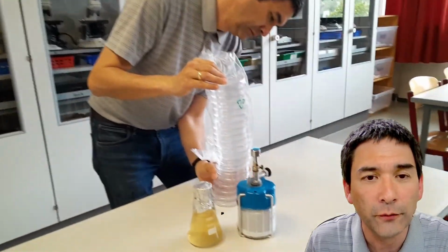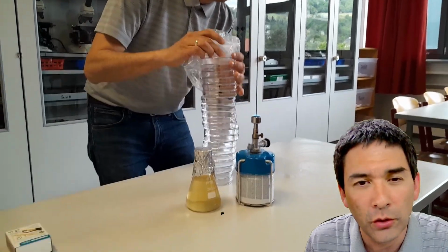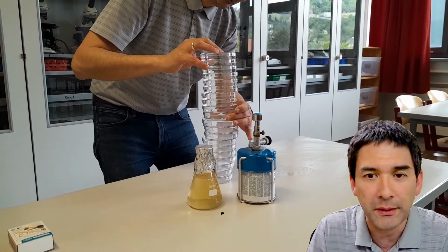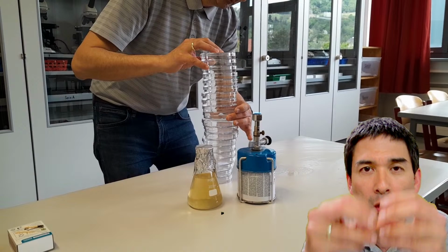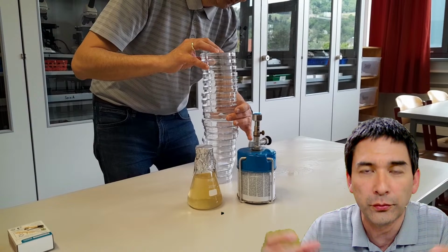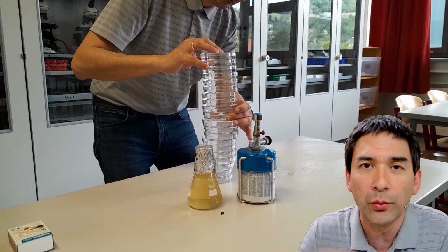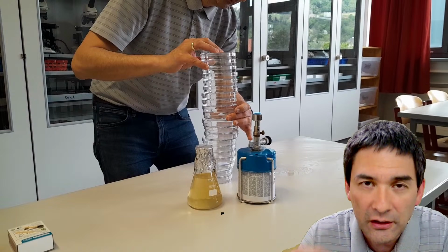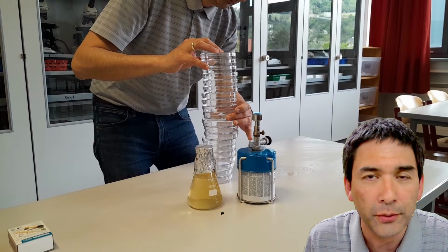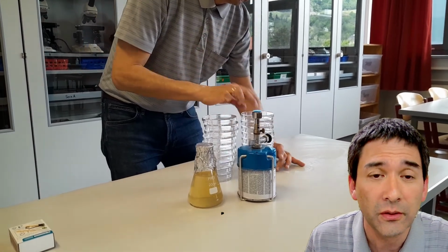I'm carefully removing the petri dishes now from their sterile packaging, and next to it you can almost not see the blue flame of the Bunsen burner. This is really important because the hot air of the Bunsen burner will create an airflow upwards. The hot air rises, and it pulls air along from the bottom. This upward airflow prevents dust and bacteria, which can be found in the air, from settling down into the petri dishes. So that's a very important way of preventing bacteria from falling down, by creating this airflow.